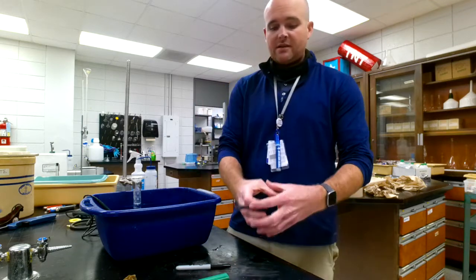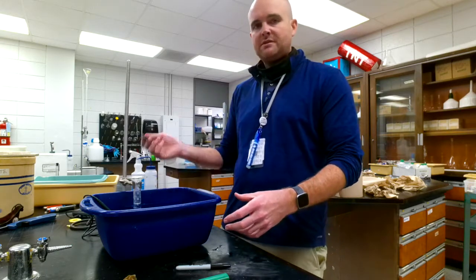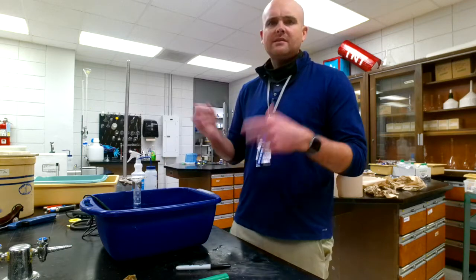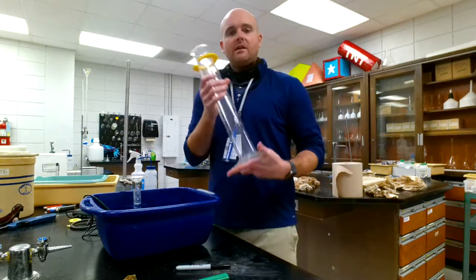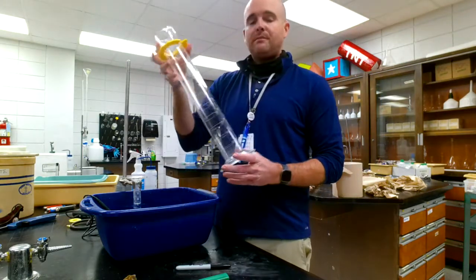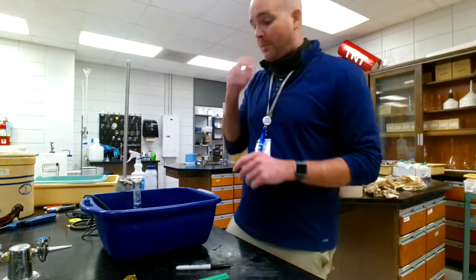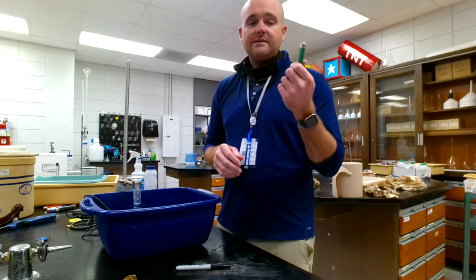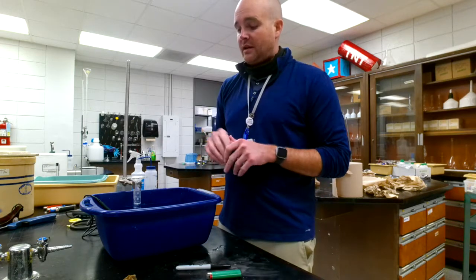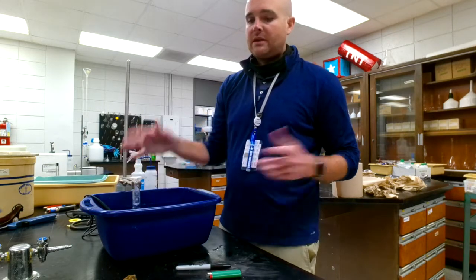You can make a gas in a reaction flask and then bubble it through a tube, and so it produces gas in here. There's lots of different ways you could do that. You could even grab one of these big guys, right, and produce your gas this way. So that's a lot of ways you could open up this experiment. I wouldn't adjust temperature too much. You can't really adjust pressure, but you can adjust the identity of the gas, and you could see how it affects your volume. So that could be your measured variable right there.